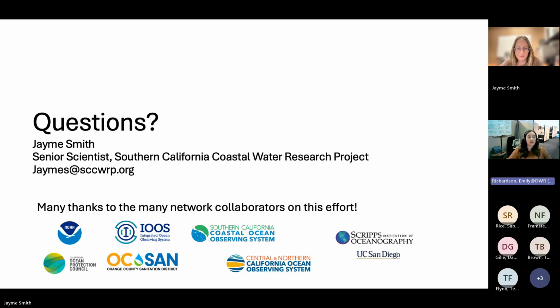So I'm wondering, say I wanted to get an IFCB and take it on my field runs, how sensitive would it be to transportation? If I wanted to just bop around and do some discrete sampling, do you think that would harm the mechanics of it to be moved around that much?